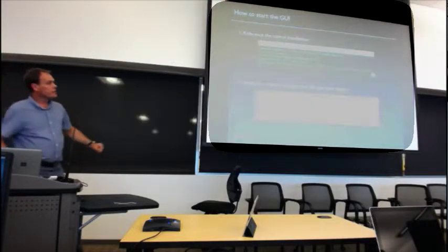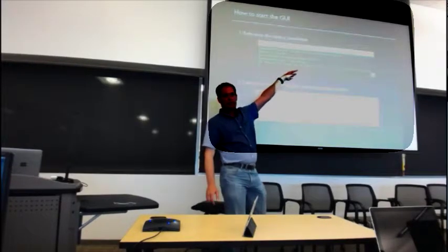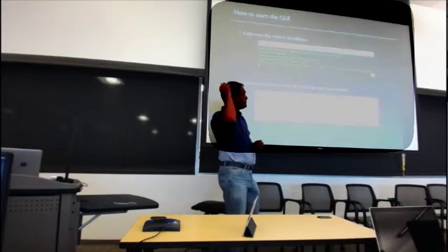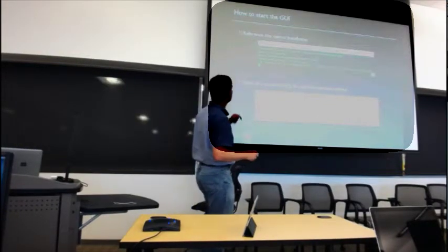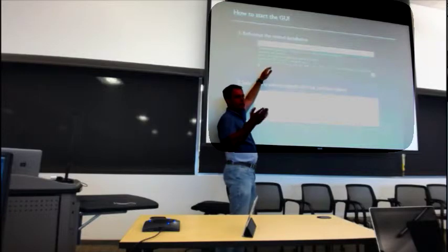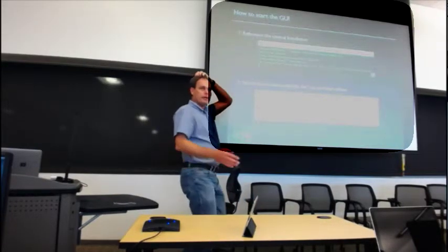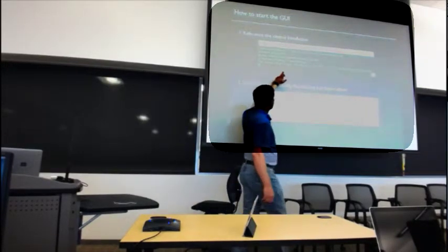Then Cheetah's centrally installed. You need to just source one of these setup.csh things. It just says, OK, point to these standard locations. I deliberately didn't do any upgrades since our last experiment, because it was about to break for this tutorial. But this I keep maintained with generally the latest updates. So when they change something in the DAQ, I update this central version, and then that means you're generally up to date. And then you start the crawler, simple command.